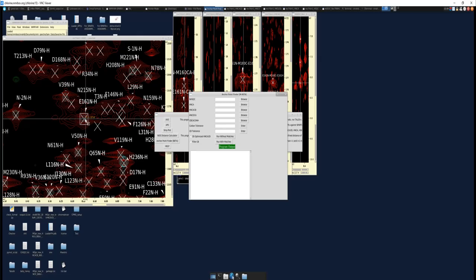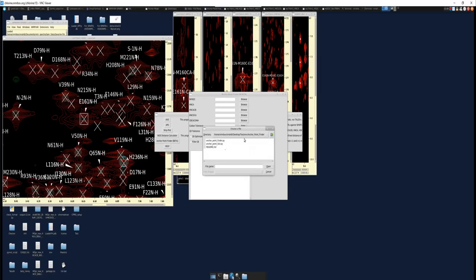So even if it's a lysine, for example, or a glutamate, that are usually not good anchor points, if they have good quality data and you can link 2 or 3 amino acids, we've just seen how using that strip plot tool that I have, along with APS, using Sparta, how you can use these anchor points to assign your protein. So there are 2 parts to this anchor point. First, you want to upload all of your peak lists. And the same rule applies here as it did with the strip plot.